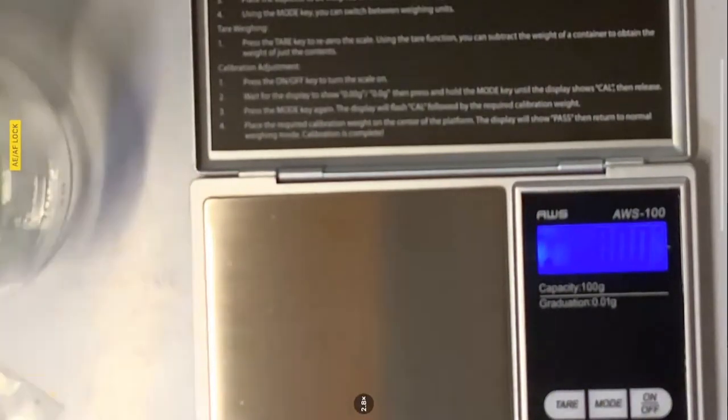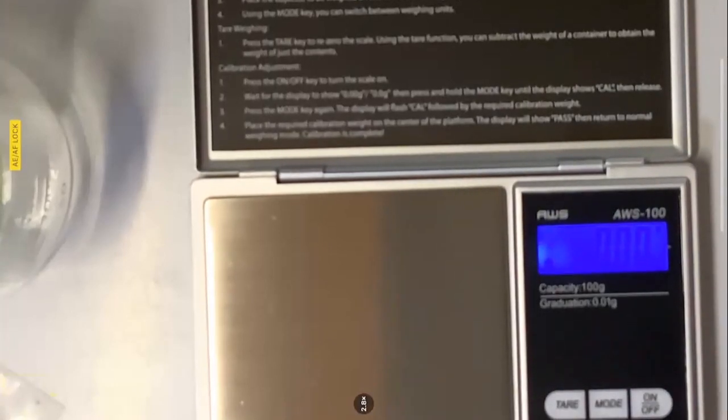Okay, I need to clean my graduated cylinder. I think you guys have a test tube brush. I don't have a test tube brush with me. So let me go ahead and get a tissue paper. Try and clean this out. I should have just gotten 3 graduated cylinders from the lab. As you can see, I'm not in the lab. I'm at home. So I'm going to go ahead and clean this test tube.